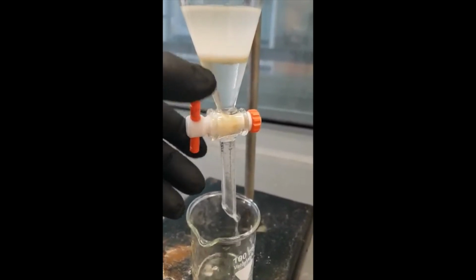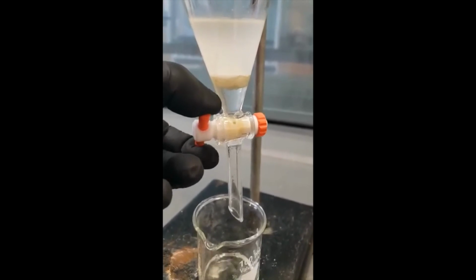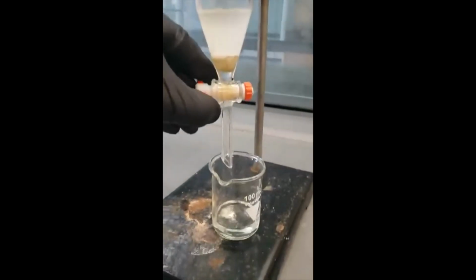Use caution here to not let any of the top layer into the beaker while trying to get all of the bottom layer in. I probably could have gotten a little bit more of that bottom layer here. Set that methylene fraction aside and get ready for your next extraction.